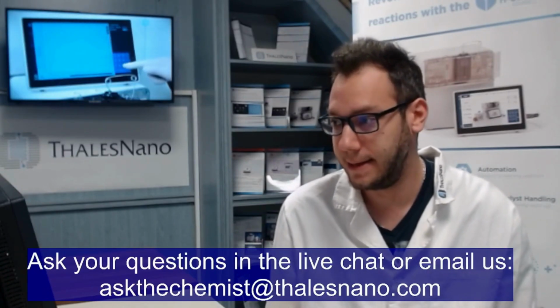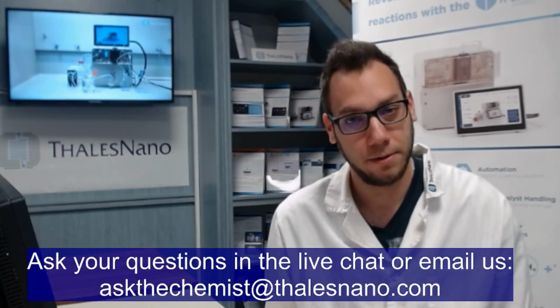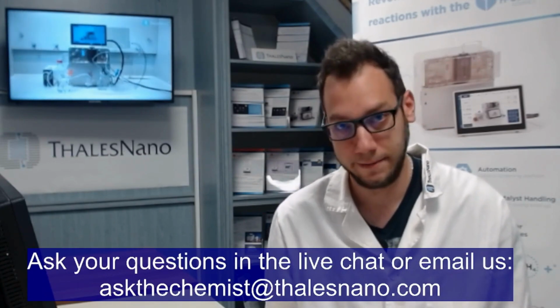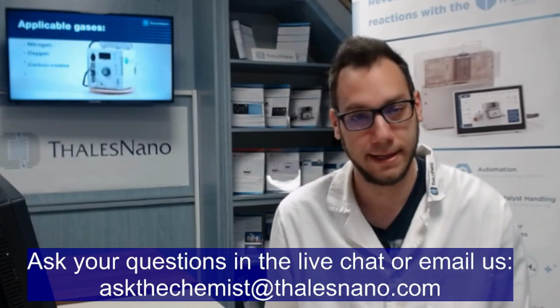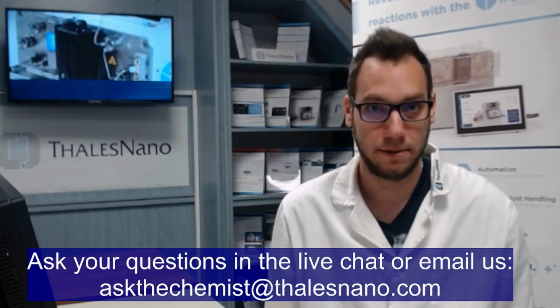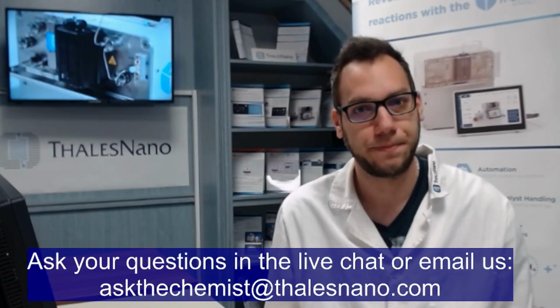The first question that we already had during the webinar session is, how long can I use a single CatCart for? That always depends on the type of chemistry. So every experiment is individual, and you have to experimentally determine the lifespan of every catalyst type, depending on the reaction that you are using. So it's specific. However, there are some general rules of thumb that you can use.